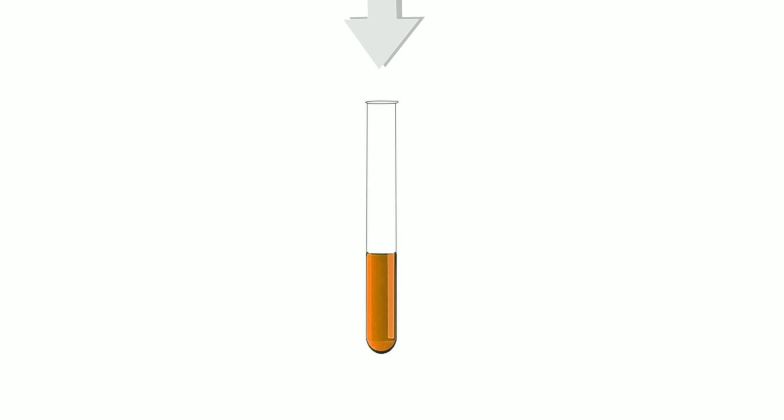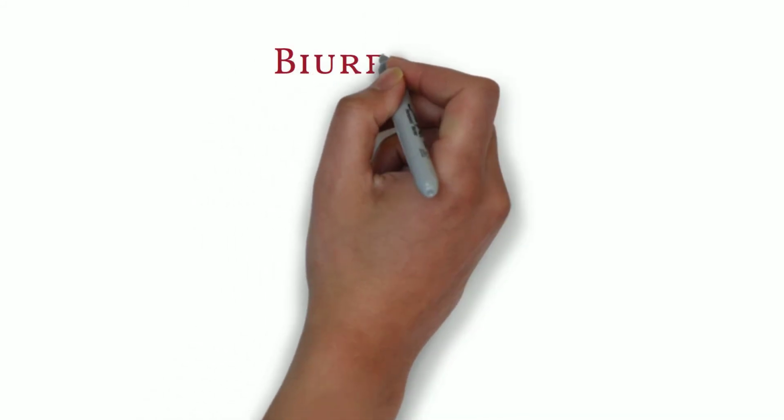In the presence of concentrated nitric acid, the aromatic phenyl ring is nitrated to give yellow-colored nitro derivatives, and at alkaline pH, the color changes to orange due to ionization of the phenolic ring.